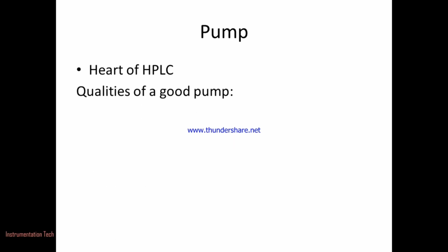Pump. Pumping systems can be said to be the heart of high performance liquid chromatography. By producing reproducible high pressures, the pump is a major factor in obtaining high resolution, high speed analysis and reproducible quantitative analysis. A good pump should have the following qualities.